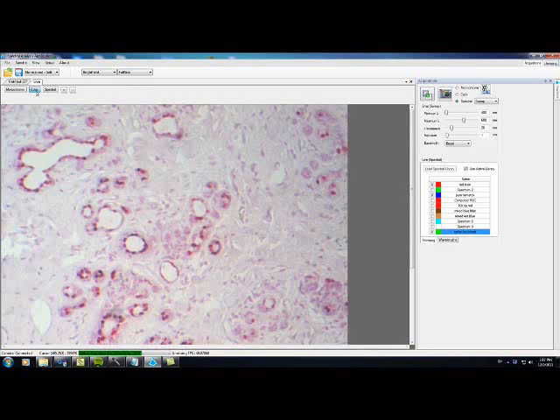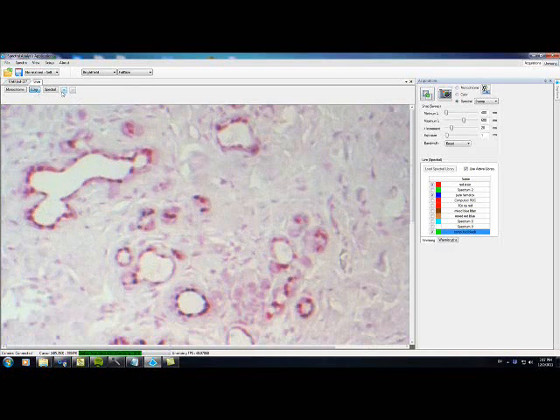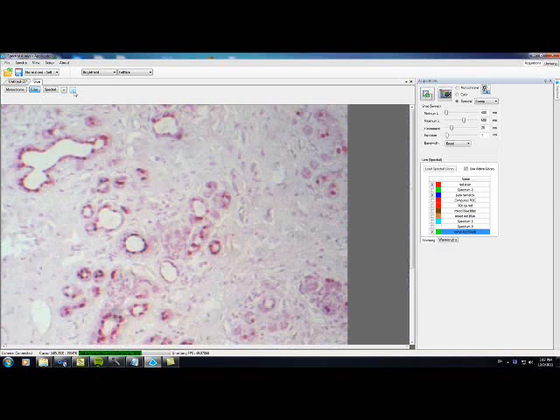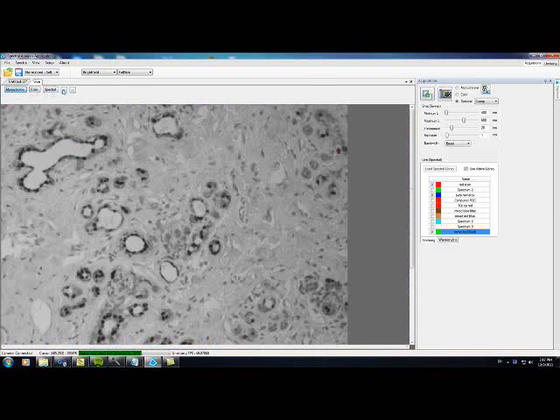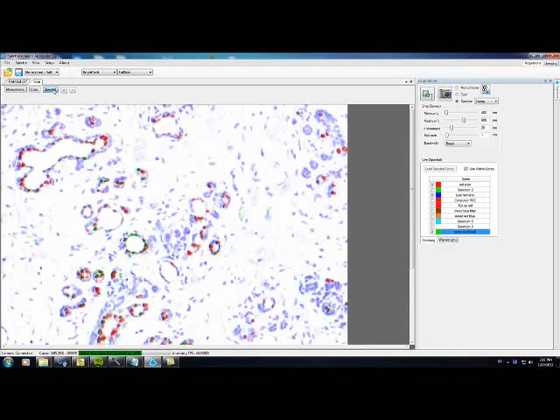The HSI 440c's unique spectral selection module can switch wavelengths, compute, and display the analyzed images in milliseconds.